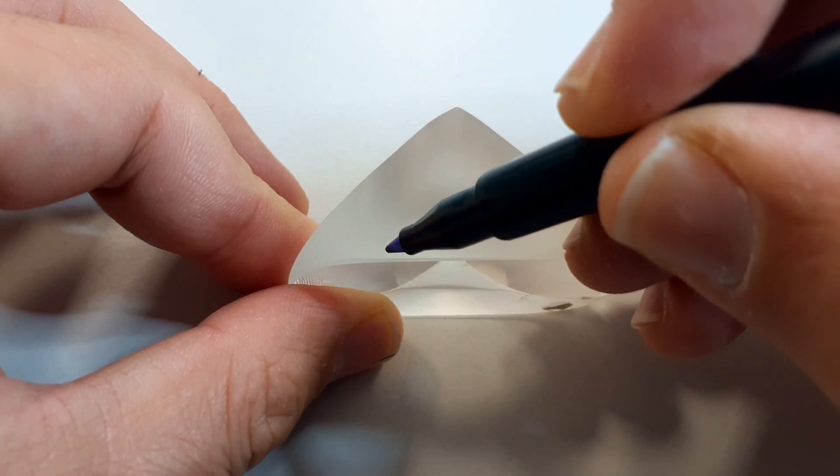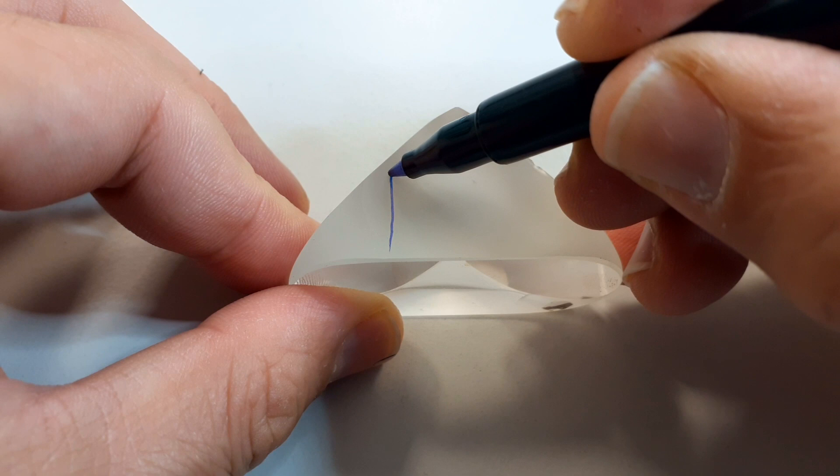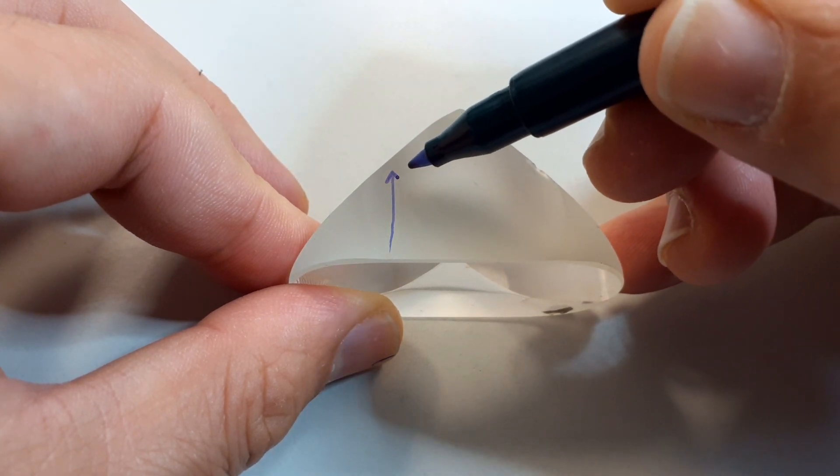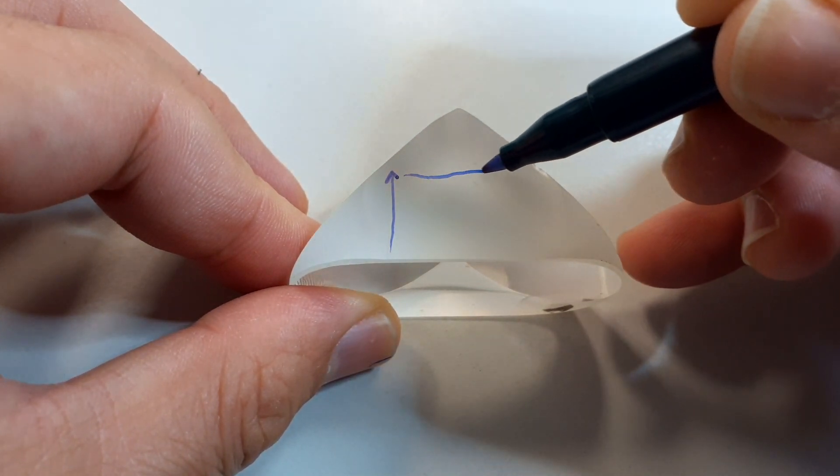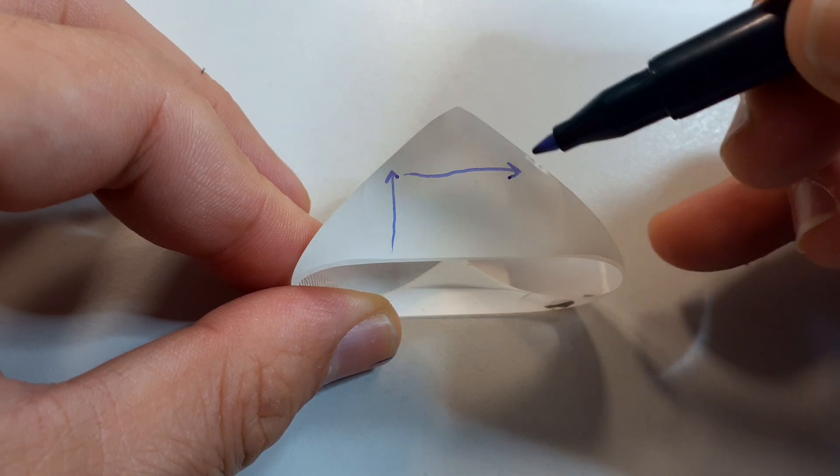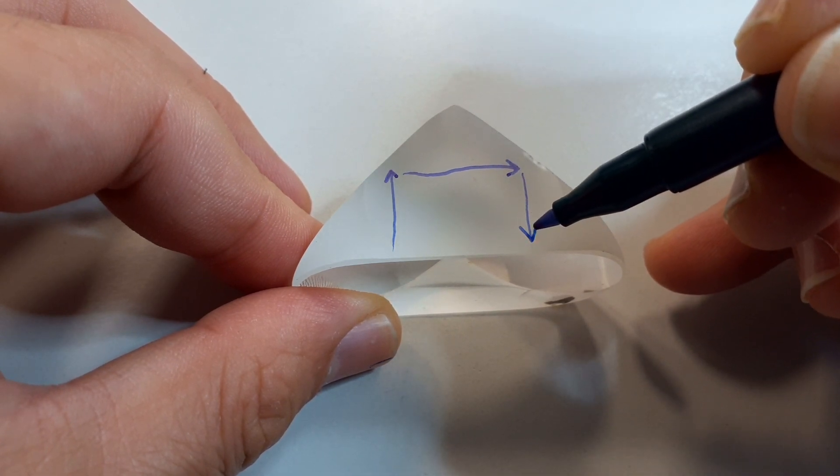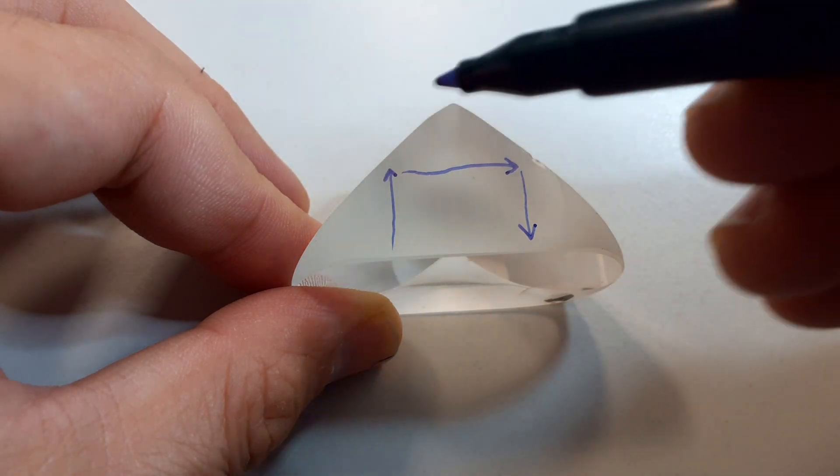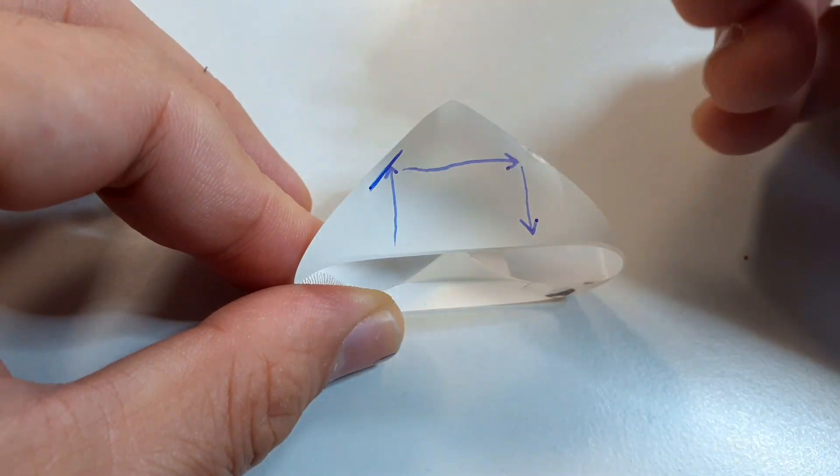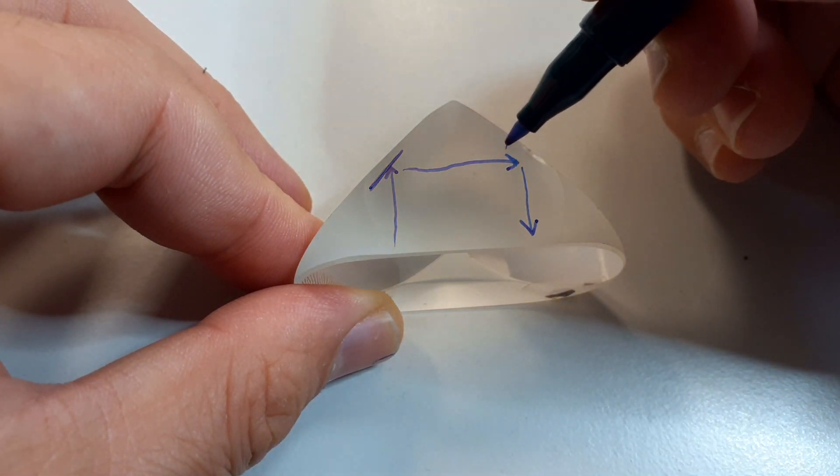I'm now using a felt tip marker to trace out the light path. So the light enters on one side is then reflected at a 45 degree angle of the prism, reflects at 90 degrees and then back out again. And this flips the image from the left to the right. And this is what we call a total internal reflection on two sides of the prism.